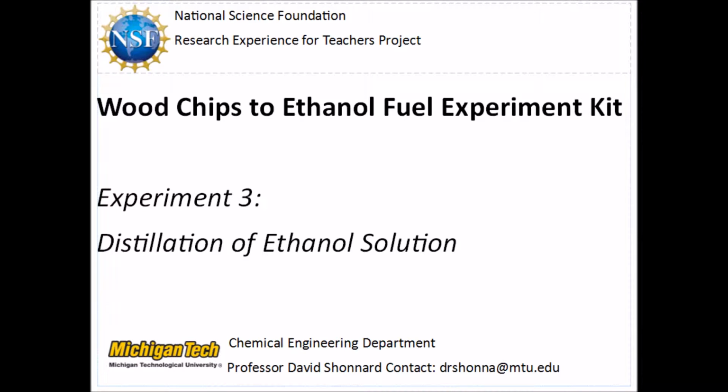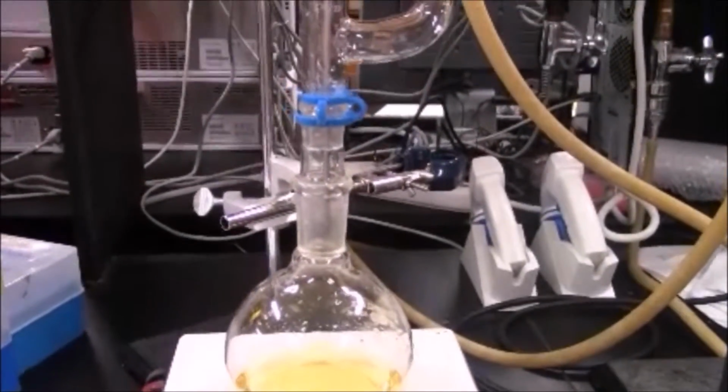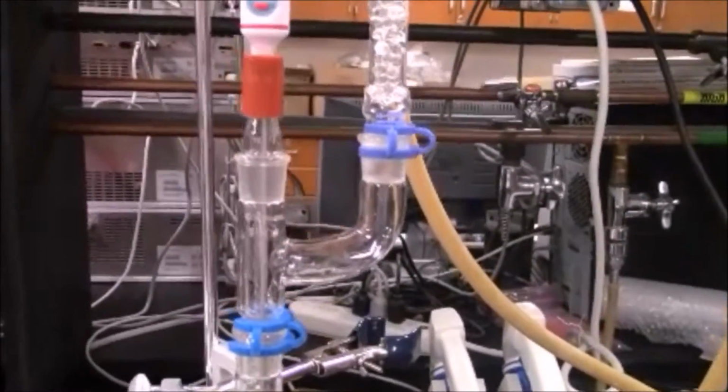The purpose of this experiment is to separate ethanol from a solution of distilled water and 190 proof ethanol using a batch distillation apparatus. This experiment can also be conducted using the fermentation broth from the fermentation experiment flasks.